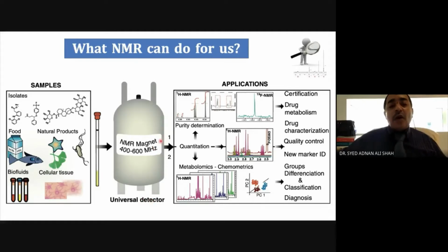And as a result of this analysis, you can get the spectrum. I will not go into the detail of how anyone can interpret it. I will just show some of these analysis results and try to show that this instrument can be used by anyone.